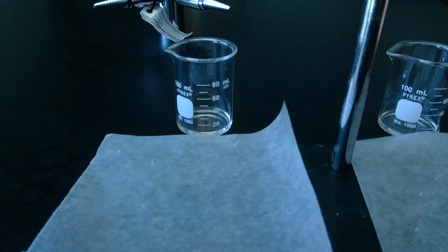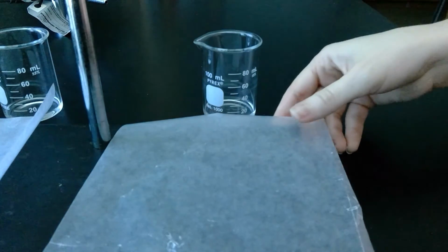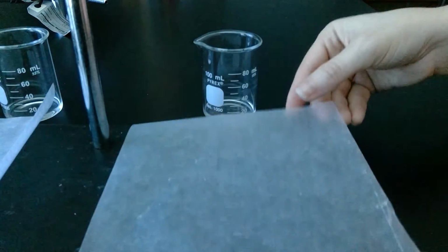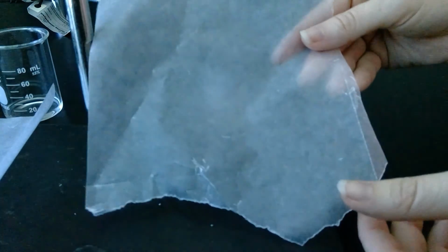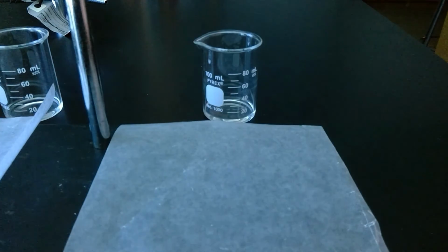So this one flattens. And finally, for hexane, this one also flattens and makes it very difficult to see, but the fact that you can't see it is just evidence that this flattens out on wax paper.